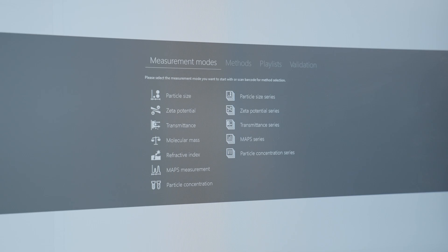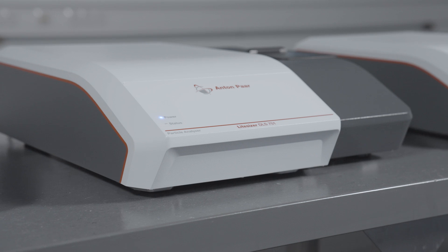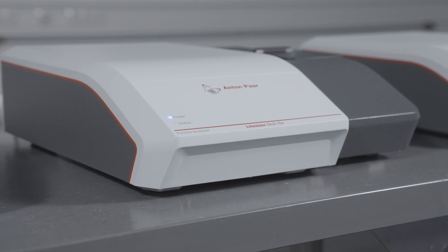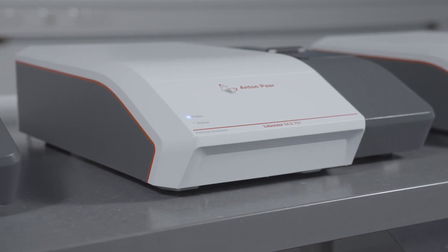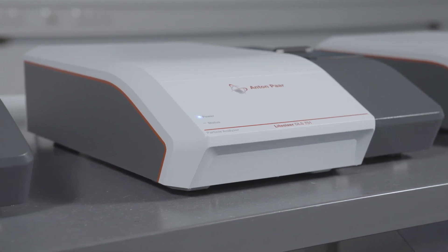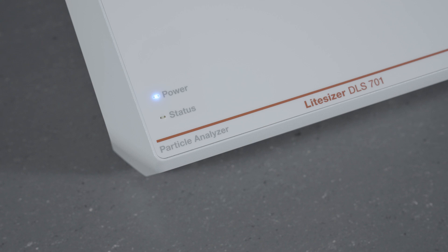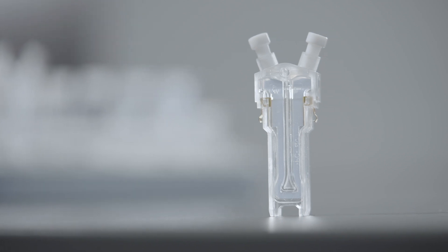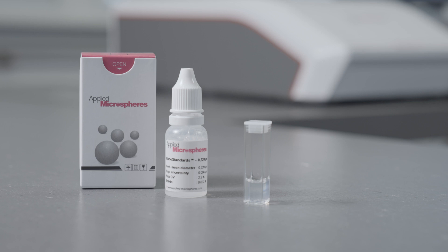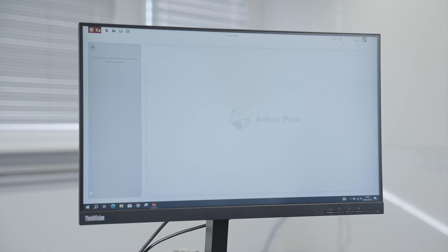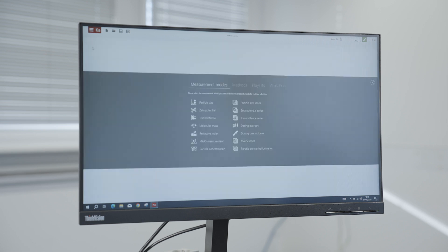Let's have a look at the main measurement modes of the LightSizer DLS, starting with a simple particle size measurement. One of the unique features of the LightSizer DLS 501 and 701 is the automatic angle selection for DLS measurements. This mechanism facilitates the measurement process and automatically selects the optimal angle for any sample. Use the 220 nanometer particle size standard for a validation measurement. To start a new measurement, click on the plus, select particle size, and enter the parameters.